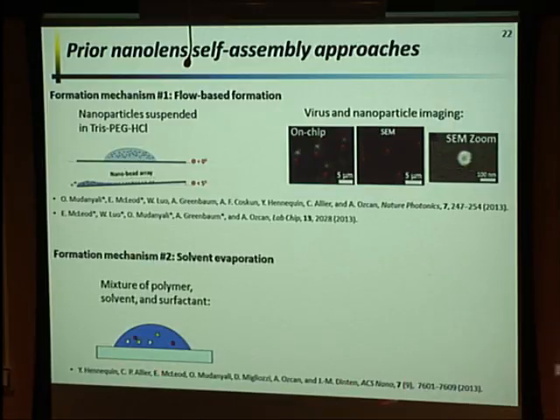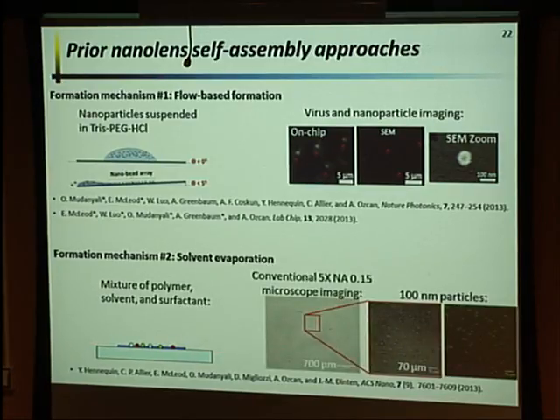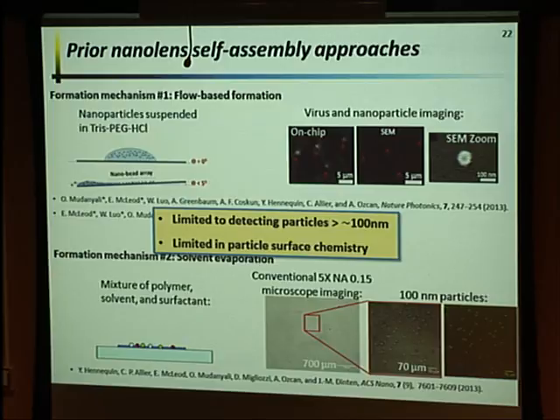We were also collaborating with a French group who were using a slightly different approach. In this case, they were using a solvent evaporation approach. And so the idea is that over time, a solvent evaporates and you get left with a very small, thin film here that's kind of buried around these particles. And in their case, they were a little bit more interested in imaging on conventional microscopes. So this is with very low numerical aperture. So you get the same sort of benefit. You get a very large field of view because we're using a low magnification objective here. But we now have much higher sensitivity than you would normally have.